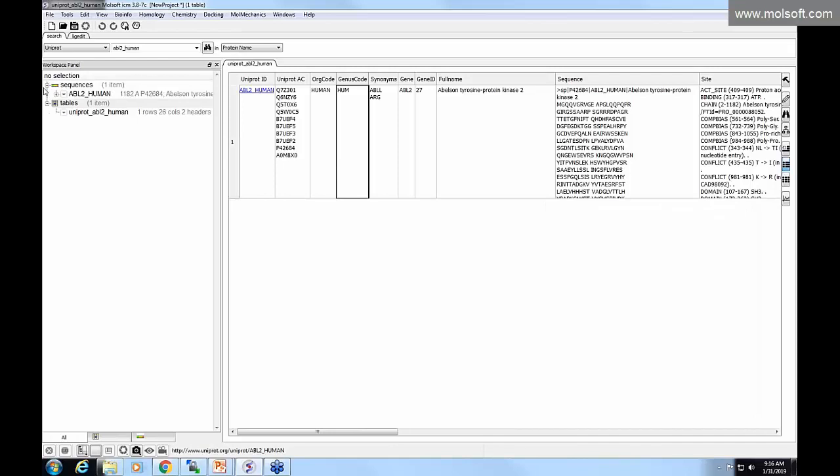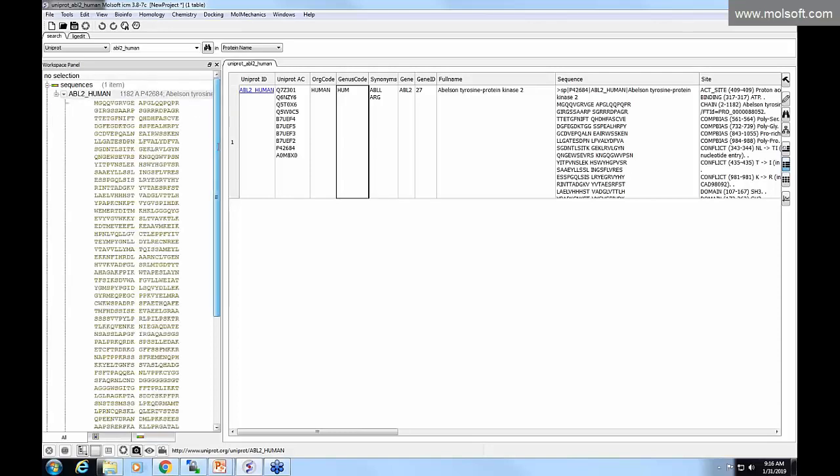You see now that we have another element to our ICM workspace called sequences, and it's downloaded the ABL2_human sequence. This is a hyperlink, will take you to the Uniprot website. So just double click here and that will load it. Okay, so now we can see that in the ICM workspace, if we expand here, we can see the whole ABL2 sequence.